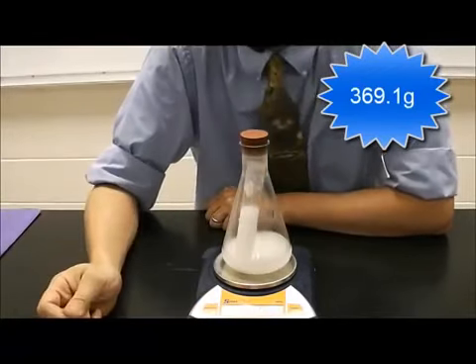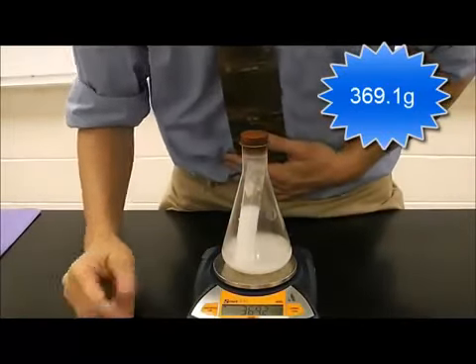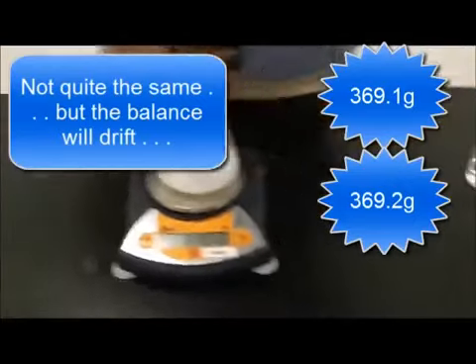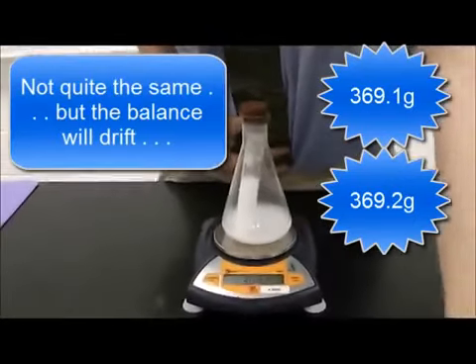When I place this back on the balance, what you're going to notice is that it's the same mass as before, plus or minus a decimal place. 369.2. Okay.